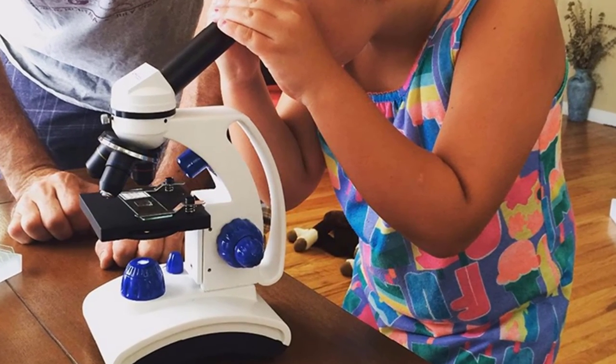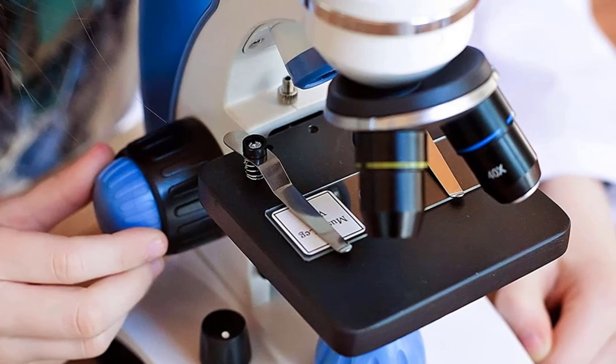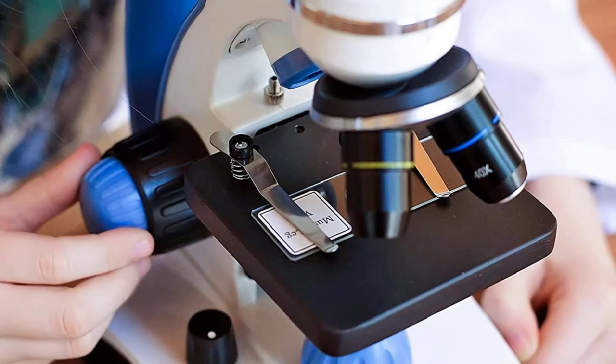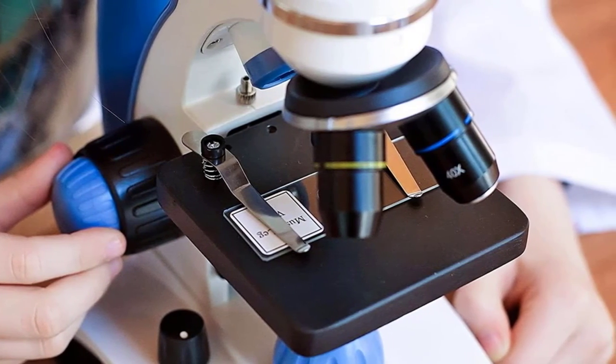The six-color filters aid with viewing specimens. Dual LED lights for extra illumination plus coarse and fine knobs for extra refinement. The best kids' microscope when it comes to all-round features at a bit of a pricey cost.